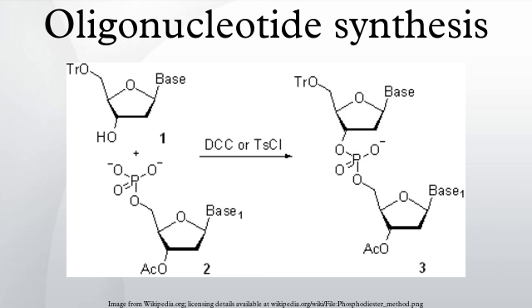The synthesis of oligonucleotide phosphorothioates does not involve the oxidation with I2/water, and, respectively, does not suffer from the side reaction described above. On the other hand, if the capping step is performed prior to sulfurization, the solid support may contain the residual acetic anhydride and N-methylimidazole left after the capping step. The capping mixture interferes with the sulfur transfer reaction, which results in the extensive formation of the phosphate triester internucleosidic linkages in place of the desired PS triesters. Therefore, for the synthesis of OPS, it is advisable to conduct the sulfurization step prior to the capping step.